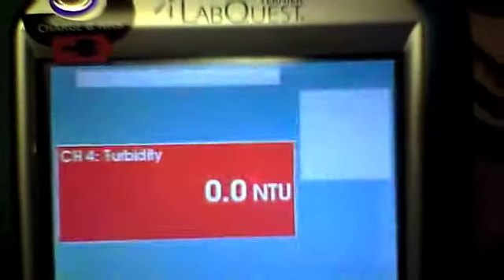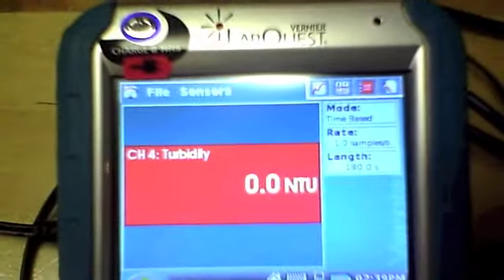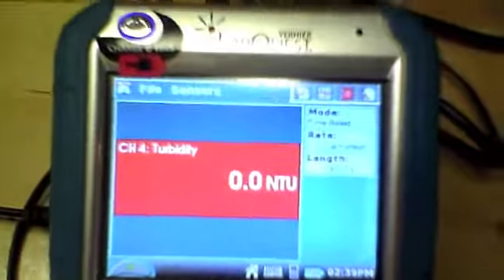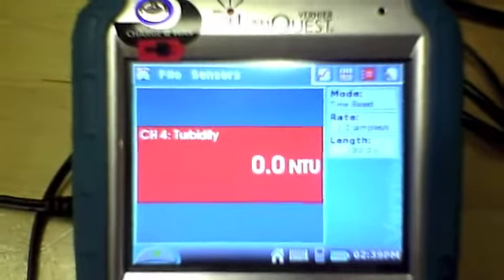You can see my cursor is splashing there. This I'm going to type in 0. And I'm going to say keep and say OK. So far, so good. Now I have to pause this to get my other sample.